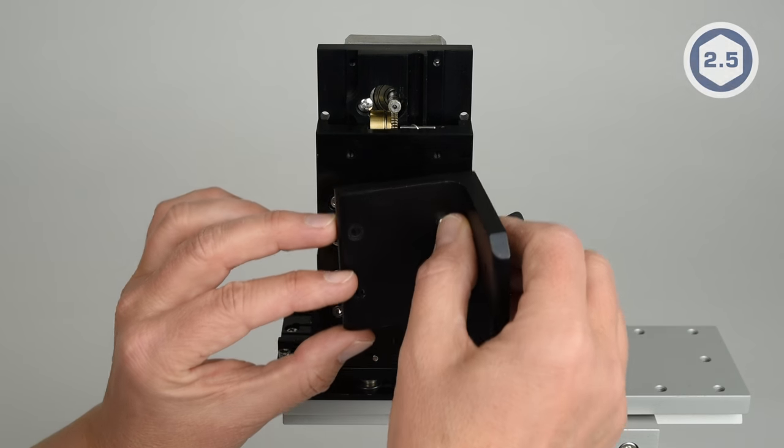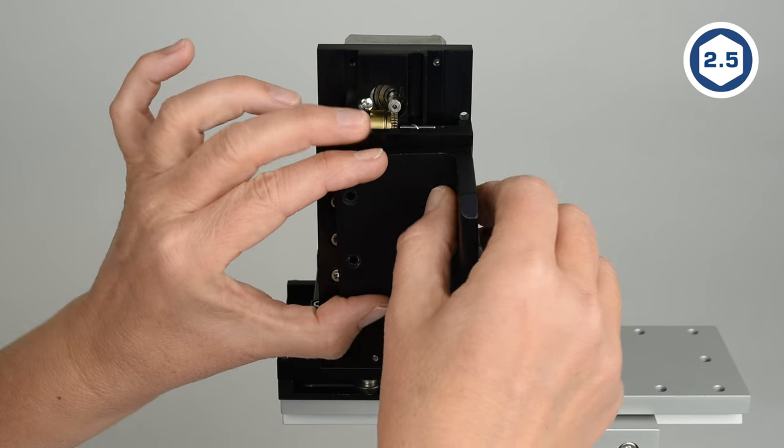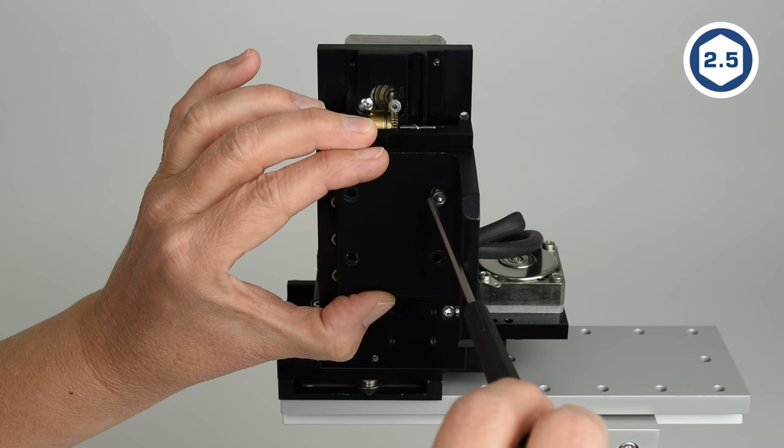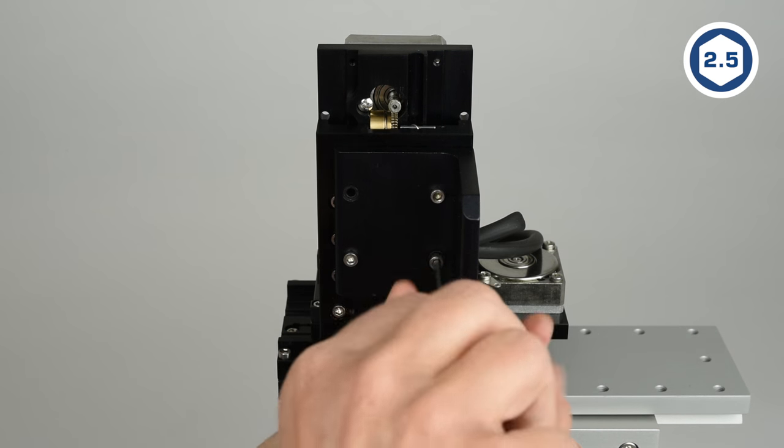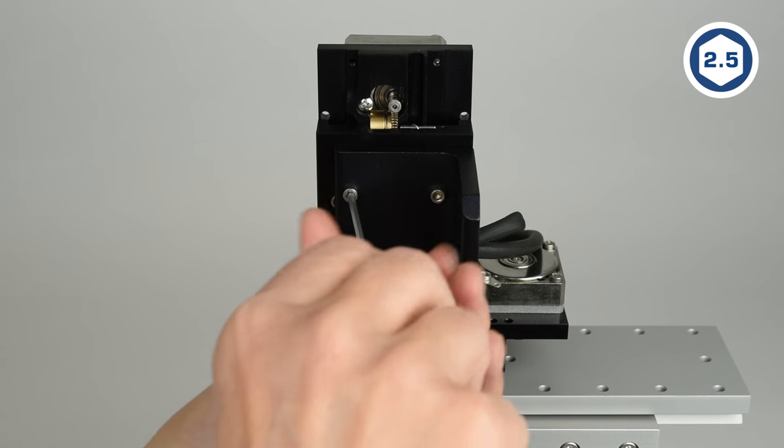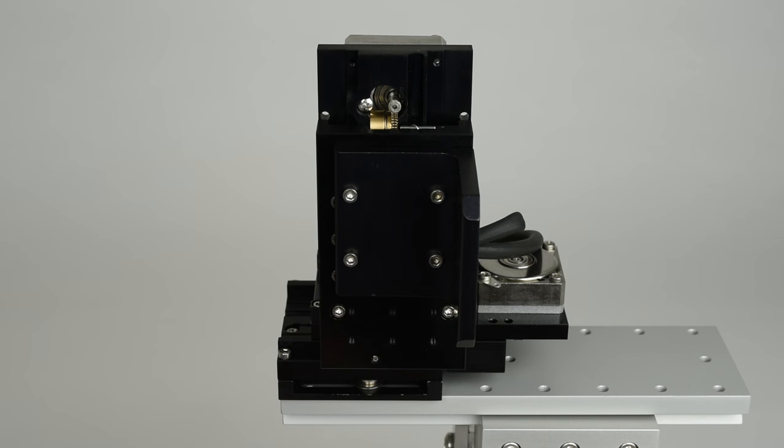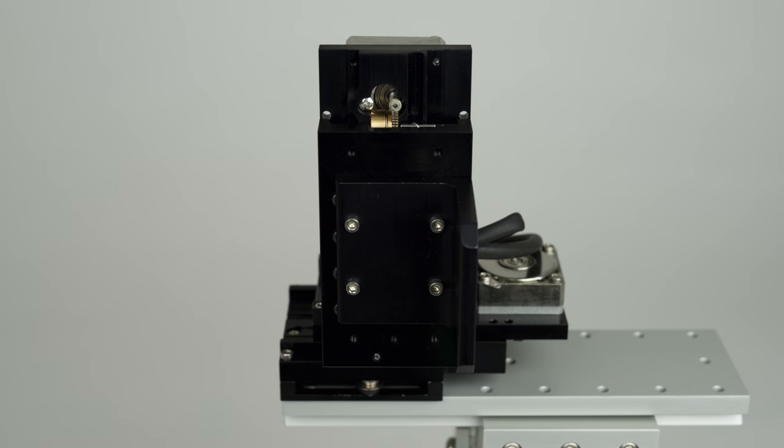Use an M2.5 Allen wrench to attach the right angle adapter to the manipulator in the same place as the swing gate with the provided M3 by 10 socket cap screws. Note that if you need a steeper or shallower angle, the adapter can be mounted lower or higher on the Z axis slide.